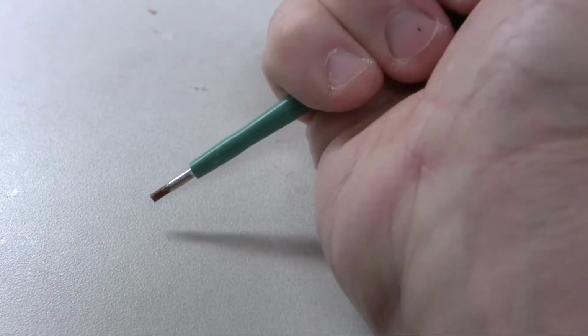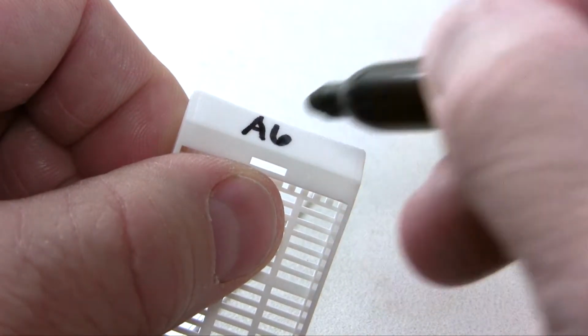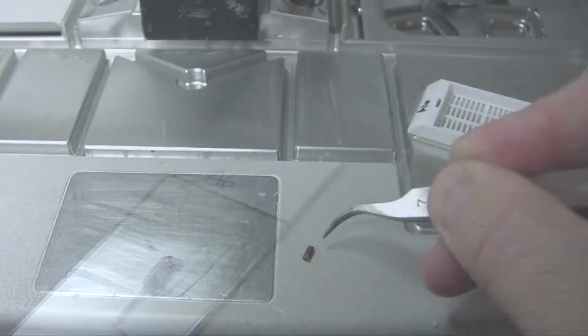To use this 2mm sausage core in a 3.5 TMA, just re-embed the core into a new paraffin block, then punch the sausage block using the 3.5mm needle and add it to your TMA.